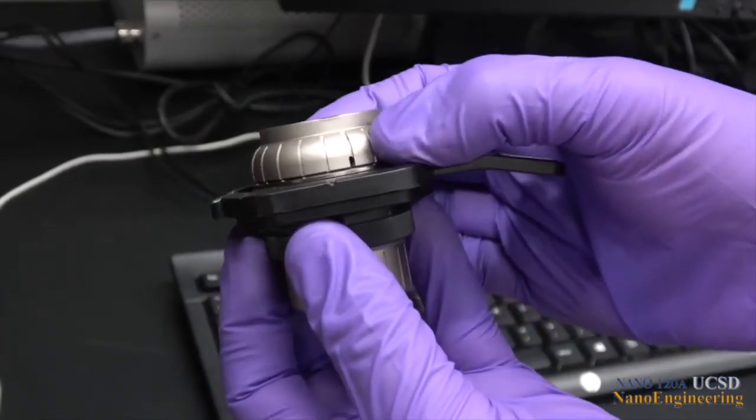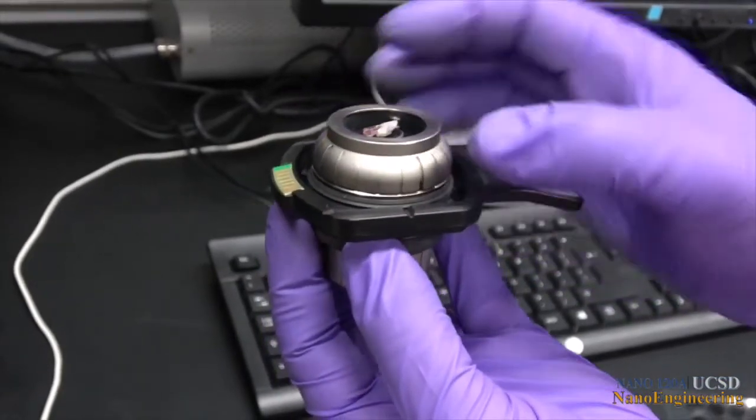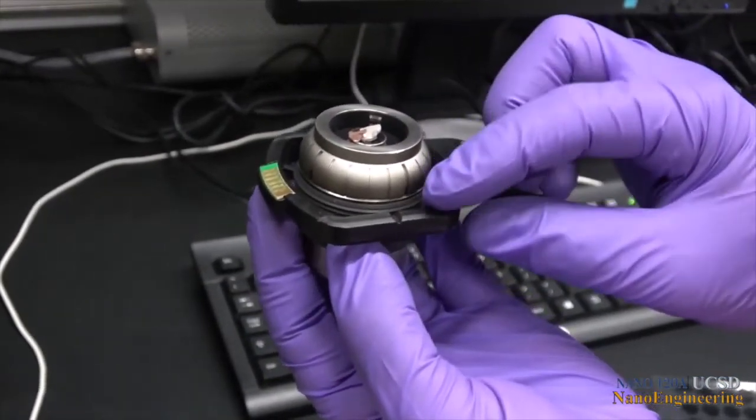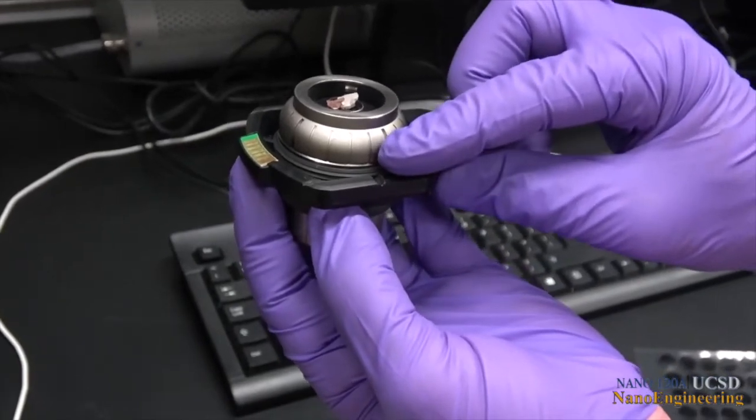Then, turn the bulb four more markings beyond that as measured from the notch on the black ring, to ensure that the sample is sitting below the top ring on the bulb.